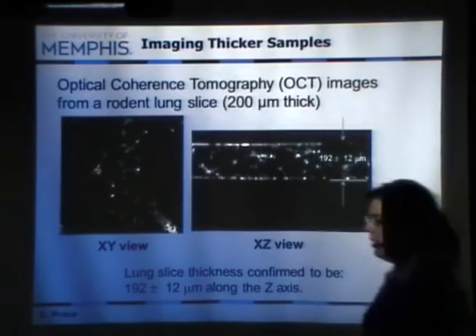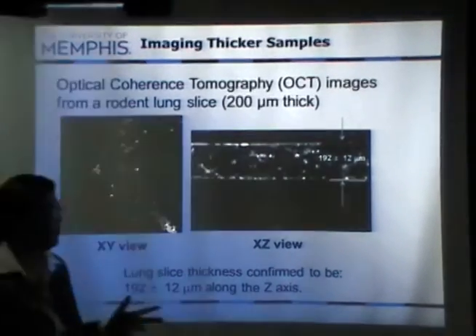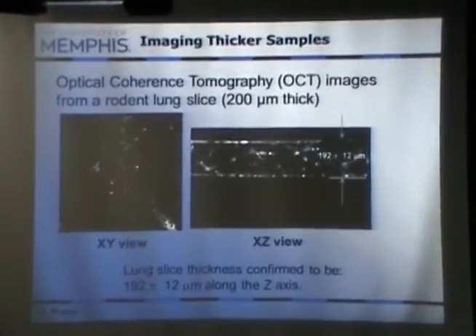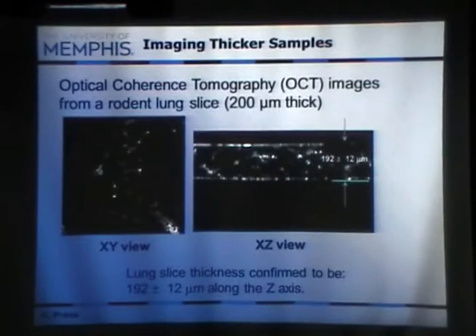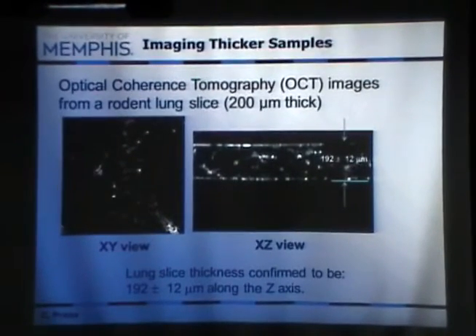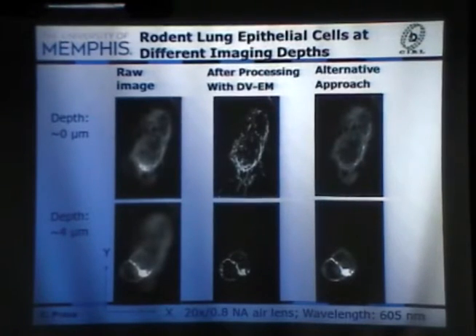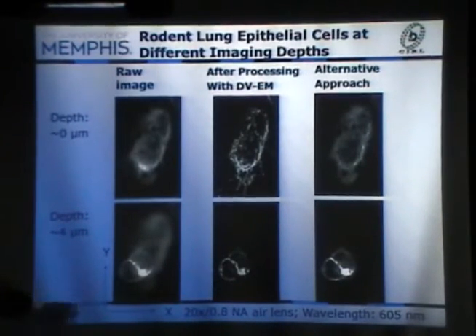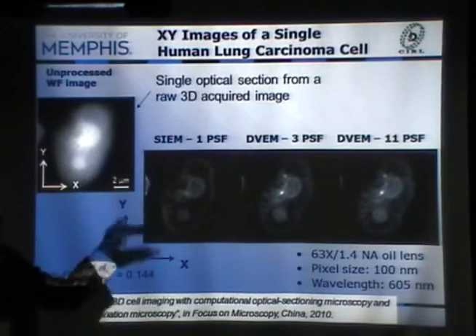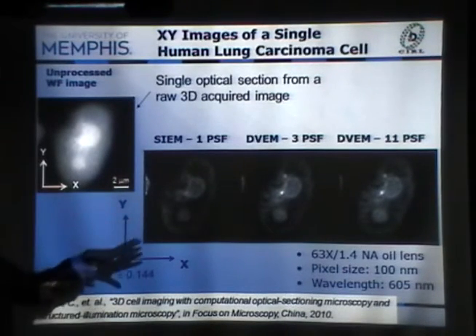So I think it's the plan that we take a break now. Okay. So, are there any questions before we do that? Yes. So you basically take the images X, Z, and your calculations. So the X, Z image, is that the one you take using the control of the process? Here, you mean, or in general? So everything that I've discussed is operating on a volume. Yes, I understand. But you compare two images, like where you have. Right. So these are X, Y images here. And this is a volume, right? Yes, X, Z. Right. So this is a whole volume like that, then we do the process, we collect the volume, and then we do the processing in 3D. And here I'm just showing you a single image in XY and a single image in XZ.